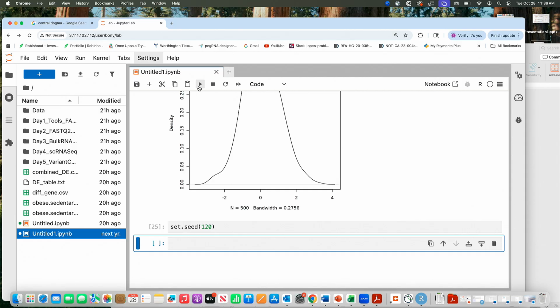So one of the practices is to always set up a seed and then keep a number that you like always. Like when you go out from home and you cross a temple, you put a coin like that. So it's like that. You put a coin, set dot seed, and then you start.